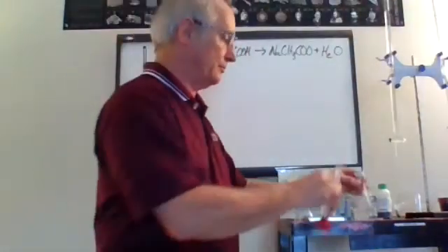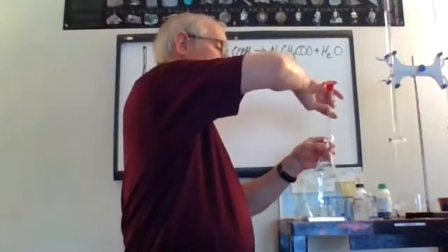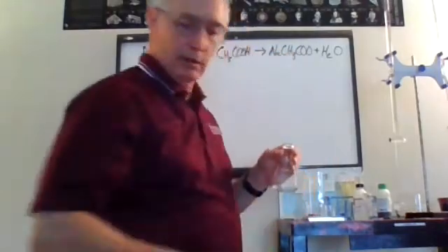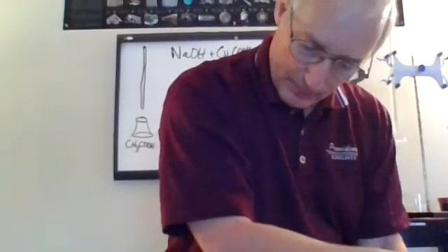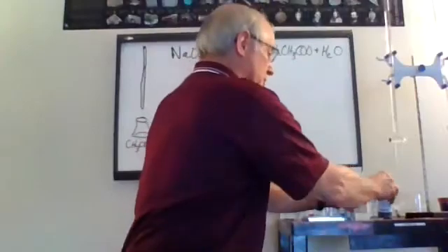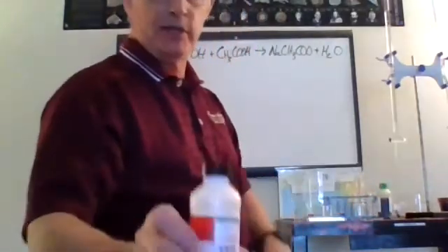Okay, and now what does it say? It says to pour the vinegar into the flask. I can do that. Got to be an Erlenmeyer flask because that's what all the professionals use. And then go ahead and add a couple drops of phenolphthalein. We could use BTB, that would be bromothymol blue, but we're going to use PH.